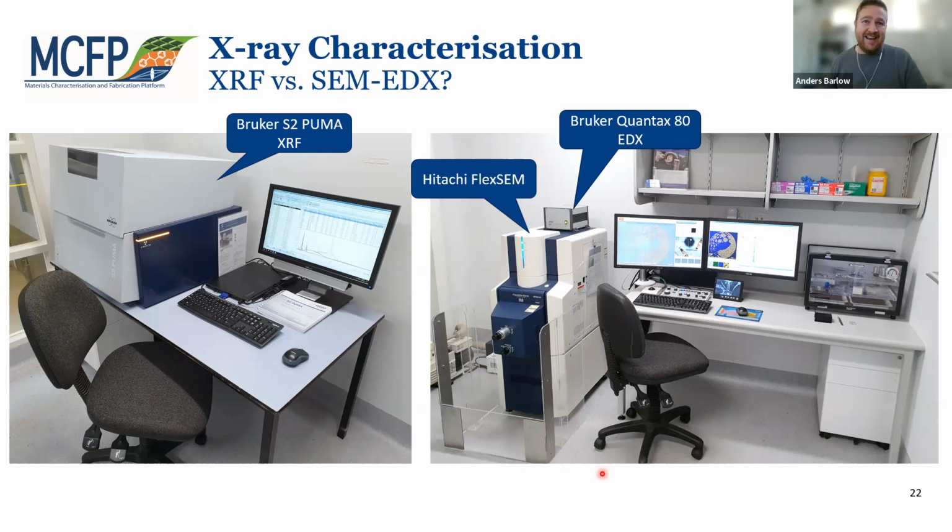If we talk about EDX, the actual physics of what's going on is basically the same sort of thing. We are talking about X-ray fluorescence from the atoms in your sample as well. However, the difference with EDX is that our probe is now an electron beam. So it's the electrons that are doing the initial core level ionization of your atoms in particular.